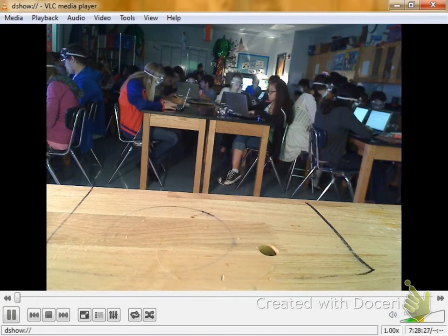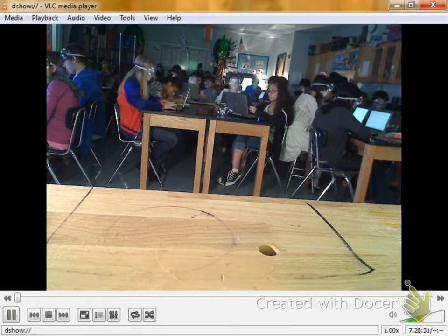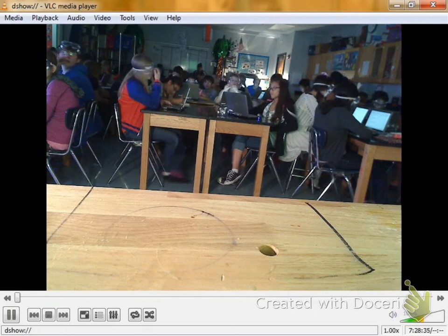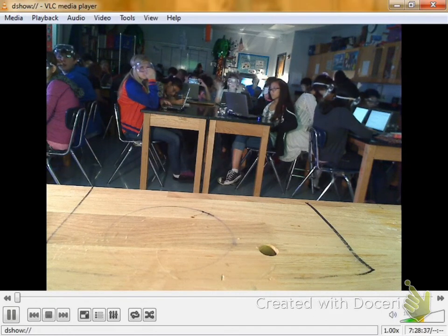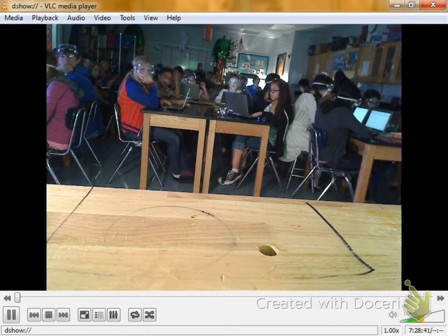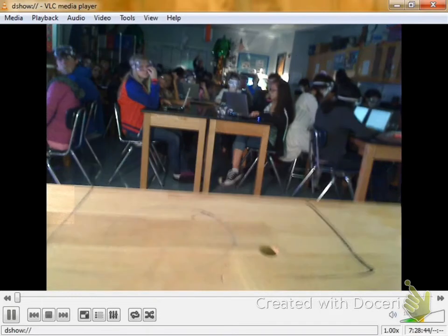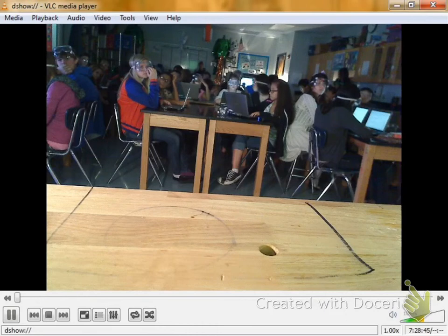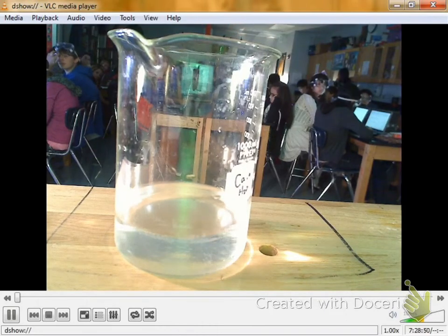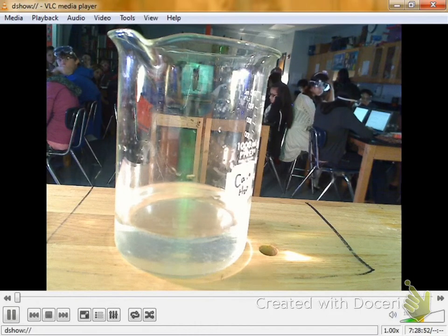Now, when I put calcium in hydrochloric acid, how did it act? It bounced around and slowly bubbled. I was saying, it bubbled, but did the bubbles form faster or slower? Slowly. Technically, they actually formed faster, but I think in your case, there was something off. All the other ones today did what they were supposed to, and the calcium didn't actually make bubbles faster.